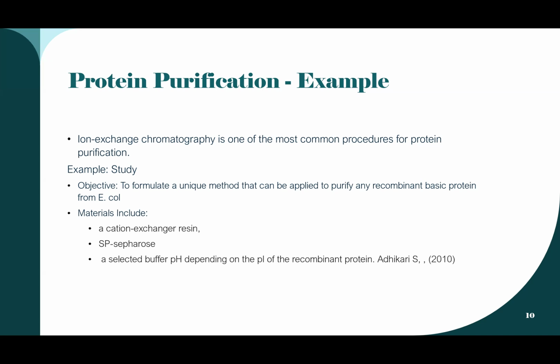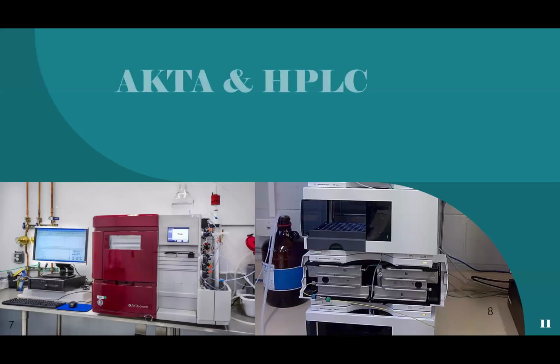And so using ion exchange chromatography, they're able to purify a protein that is very difficult to obtain and mass produce. And so that's one of the benefits of using ion exchange chromatography and how it's used in industry.